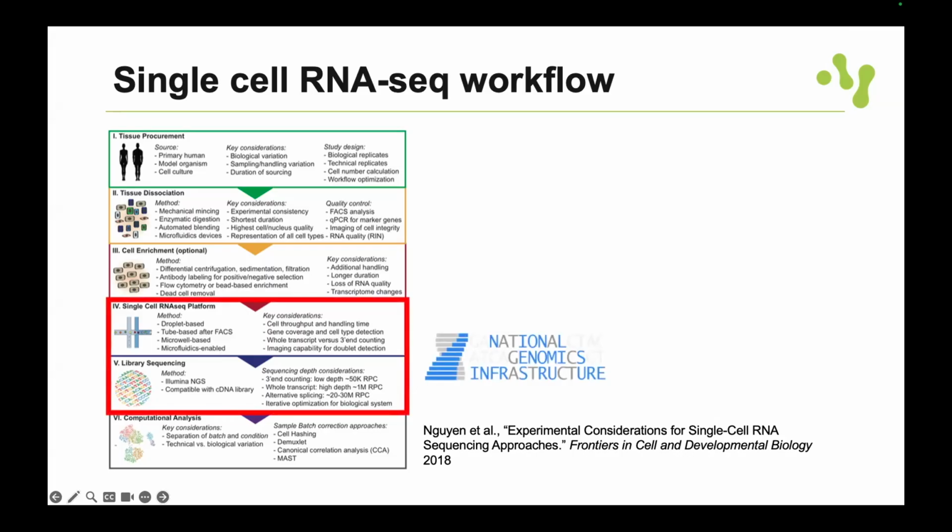Just to mention here, these parts, the NGI, is what could help you to actually do the sequence library preparations and sequencing. So NGI has services for that.